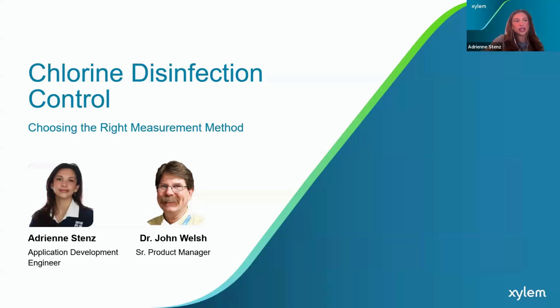Whether you work in drinking water or wastewater, chlorine is likely a part of your disinfection strategy. Today's webinar will explore the difference between online DPD analyzers and amperometric chlorine sensors, helping you choose the right measurement method for your chlorine disinfection process.